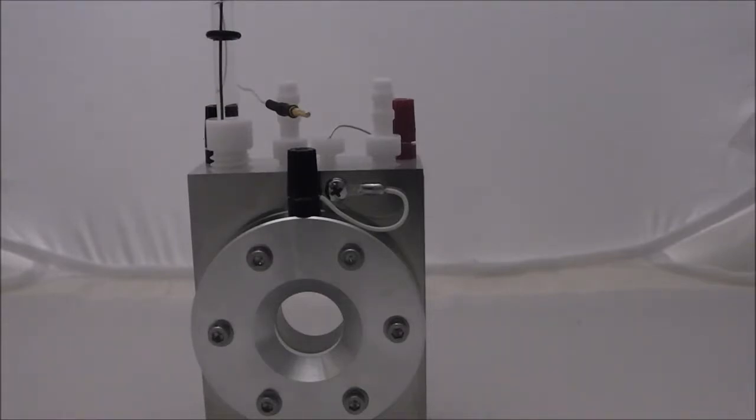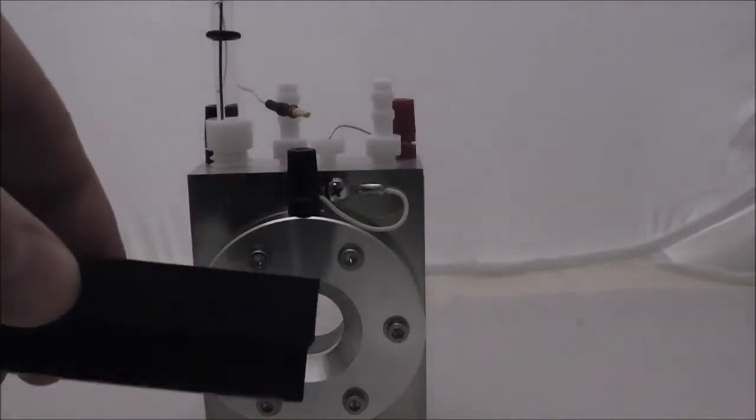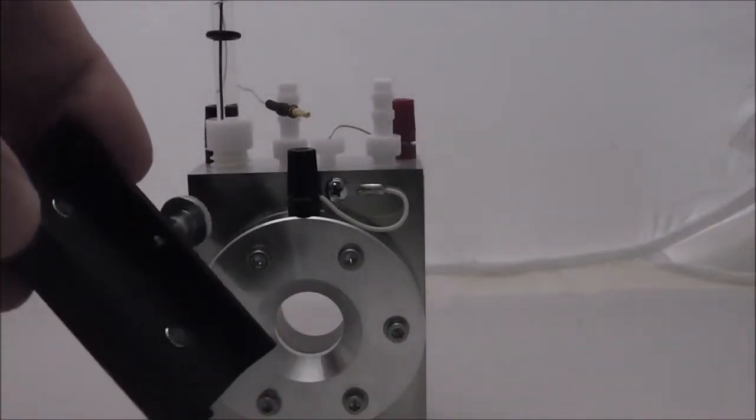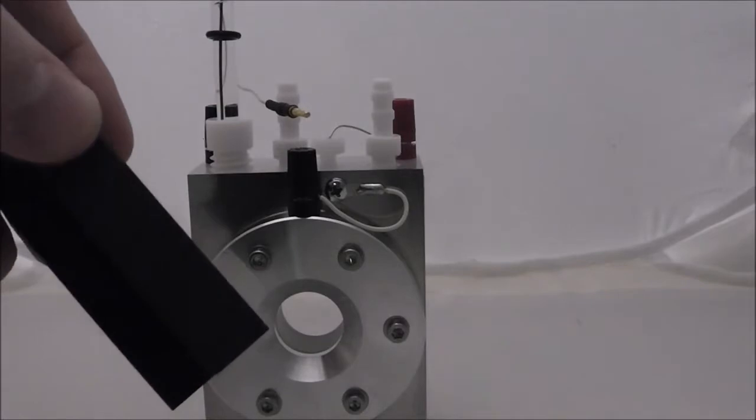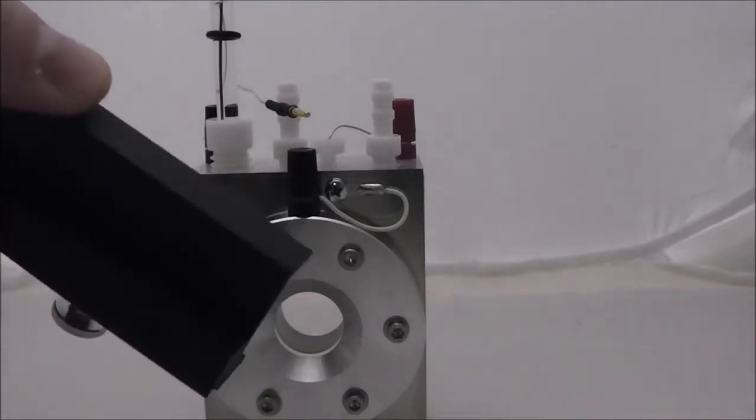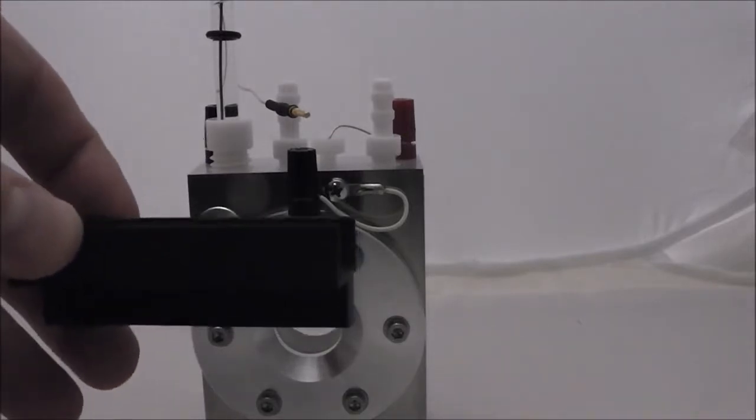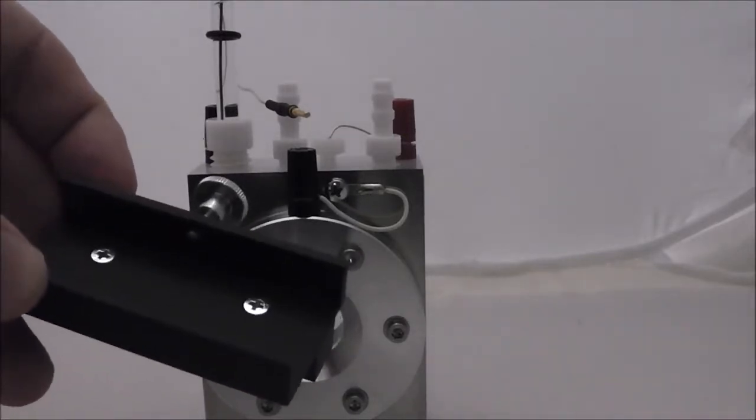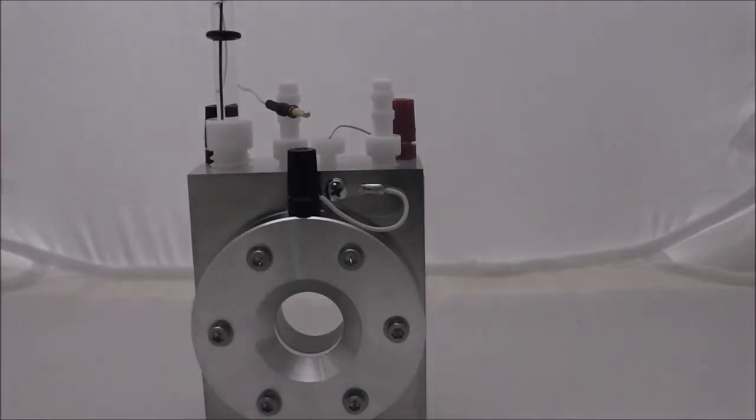They have application notes on solar cells and dye-sensitized solar cells. They give an adapter with the system, and the adapter allows the cell to be put onto a station so that you can control the position and orientation of this cell. Again, the experimental setup is very repeatable.